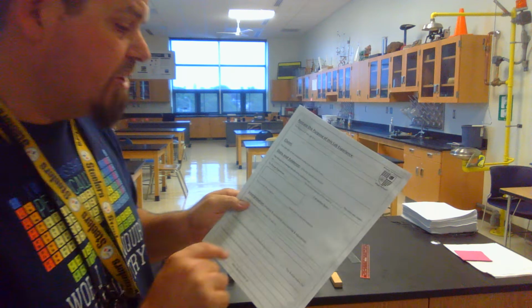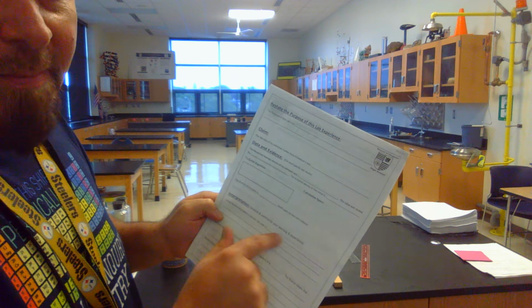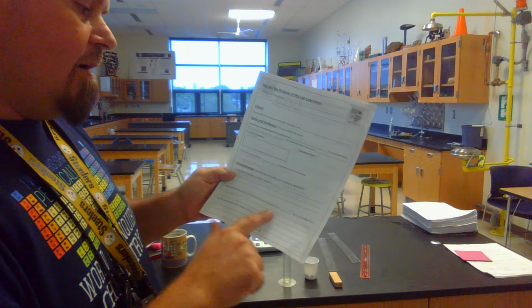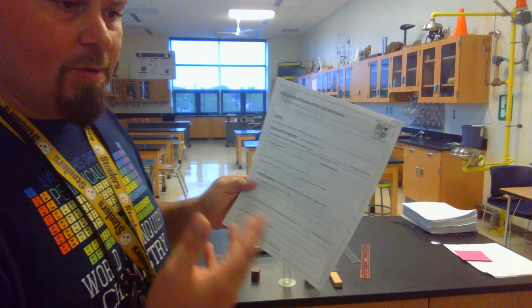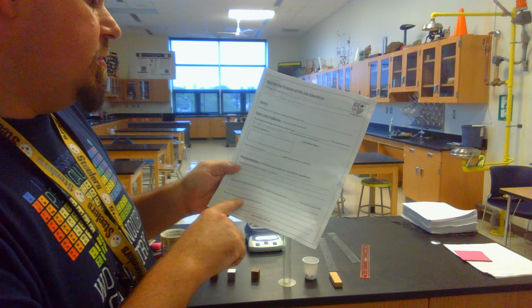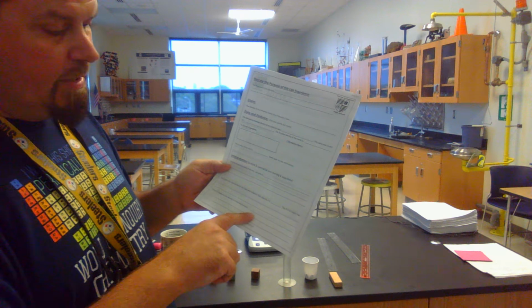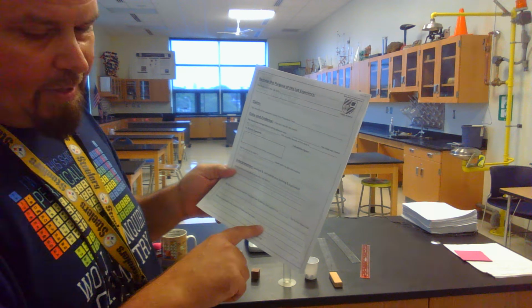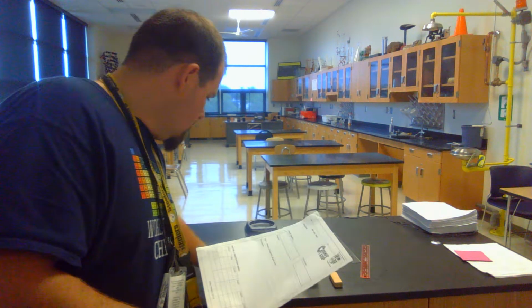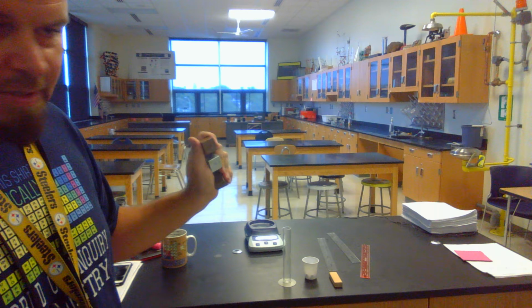Interpretation. This is where we analyze and summarize. Use the physical property of density. I am able to identify my unknown as blah, blah, blah, because, right? Percent error means that you're a little high, you're a little low, okay? Density is related to the identity of materials because what is the definition of intrinsic property? You should be able to look that up. You take care of all this and this lab is done, and you'll be able to tell me which one of these 3 blocks that you pick, all 3 are different metals, whichever one you pick, you'll be able to tell me what kind of metal it is.